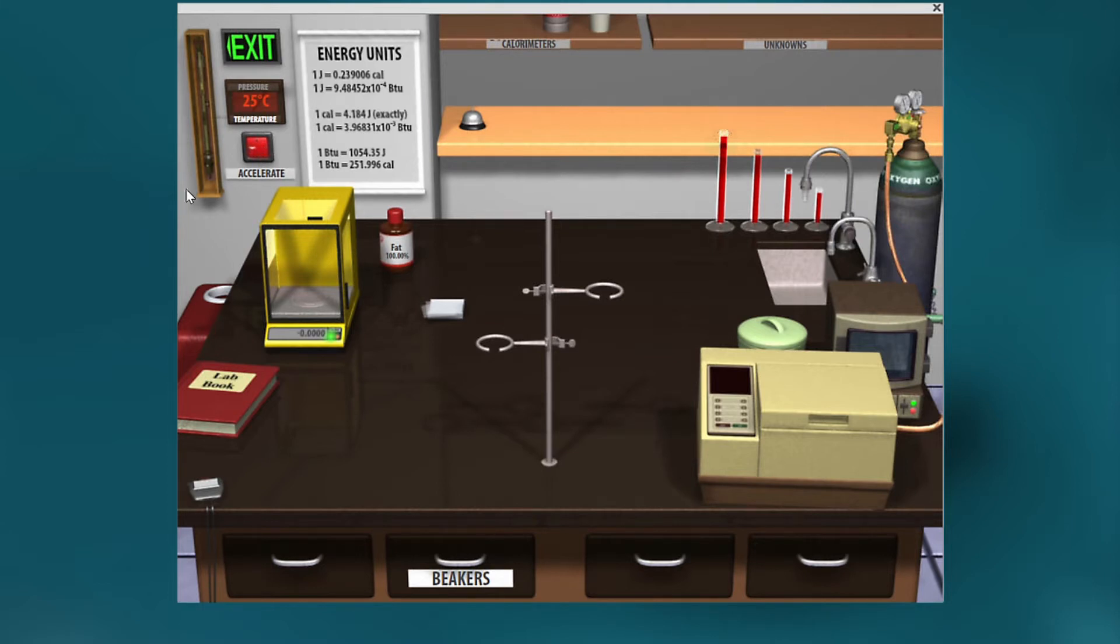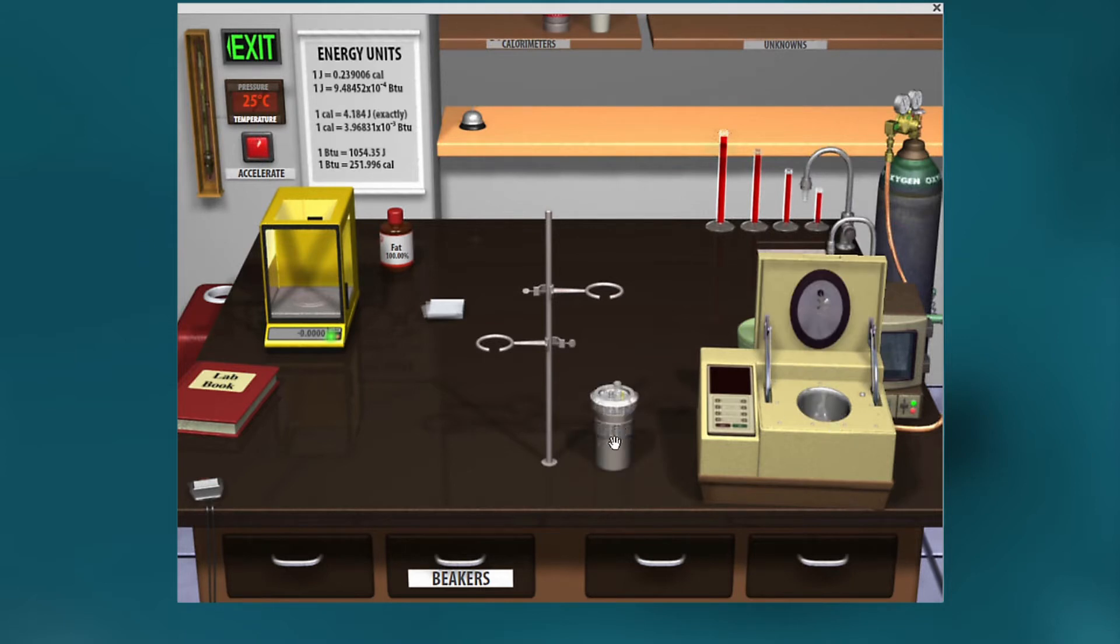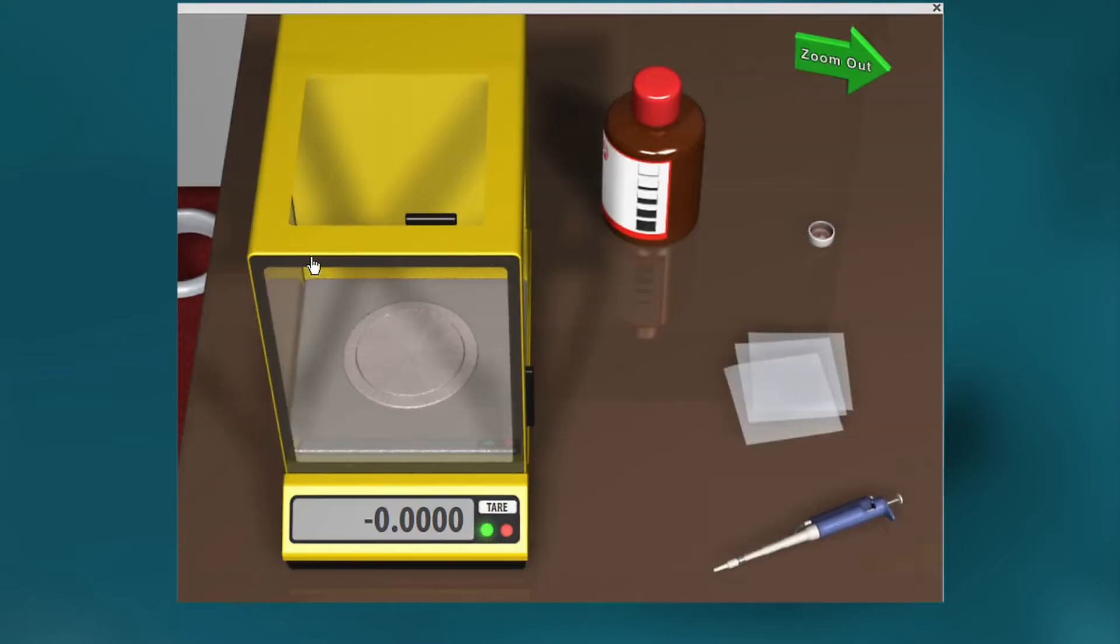So here we go. This is a calorimeter, it's called a bomb calorimeter. We'll take out the bomb and the dish that we're going to measure the fat into, we're going to take it over here to the scale, and we'll measure in about one gram of chicken fat.